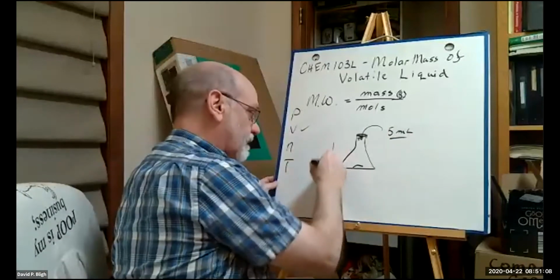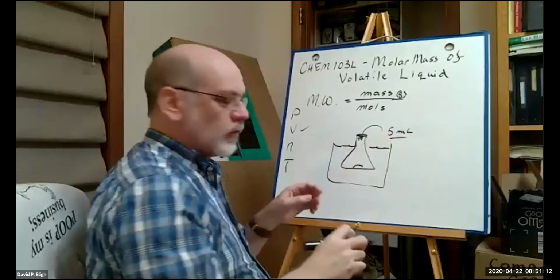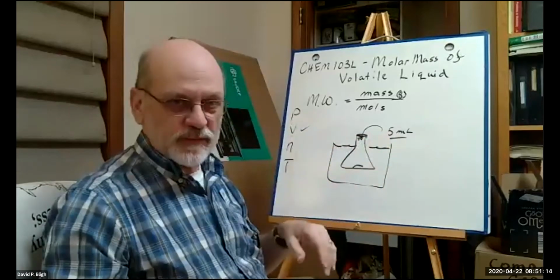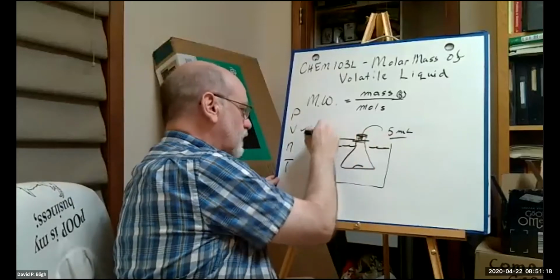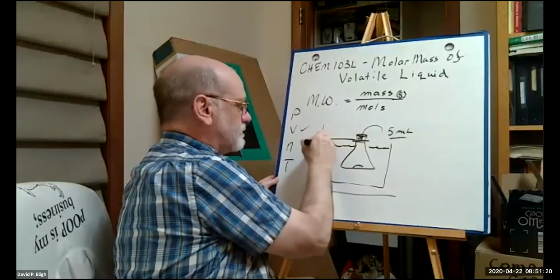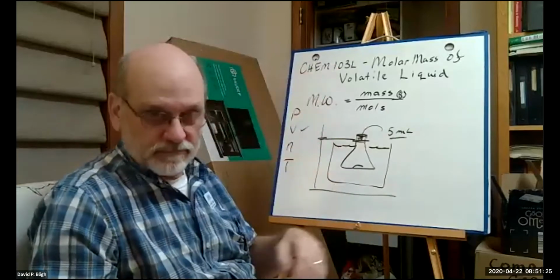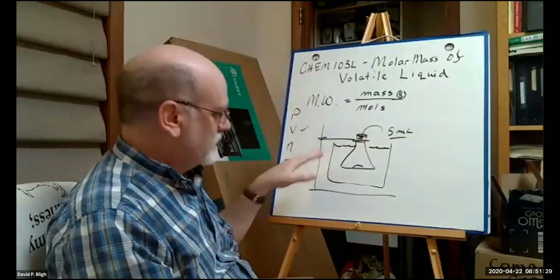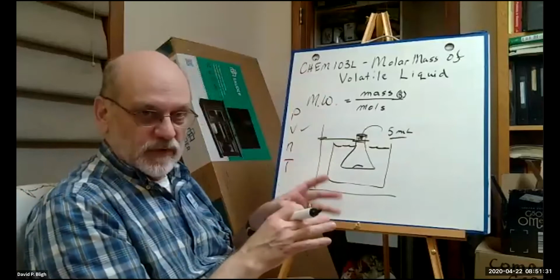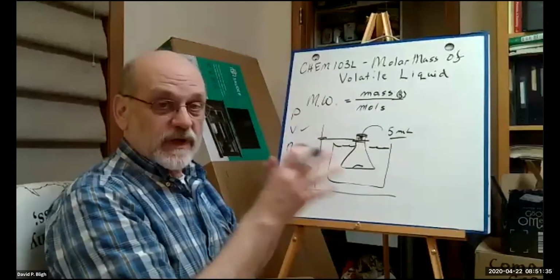Okay? So there's your water bath. And you try to submerge it as far as possible. And you put a clamp around it that goes over to a ring stand. Right? So you can lower it and raise it up without burning your hands. So you put it in that, and there's a cap on it. Before you put it in there, you put your liquid in there, and then you put a cap on it.